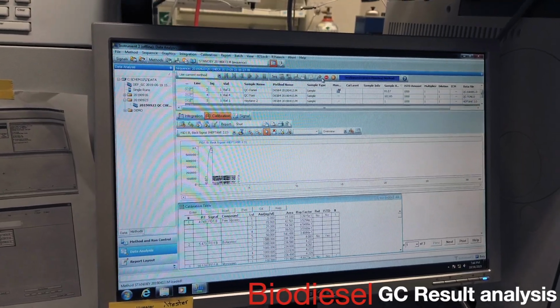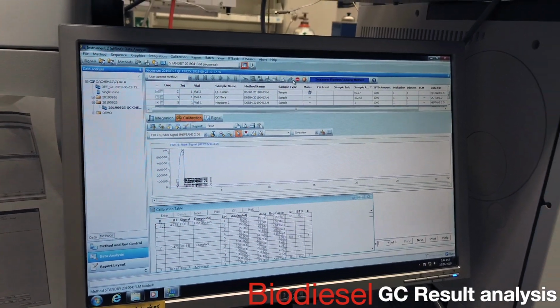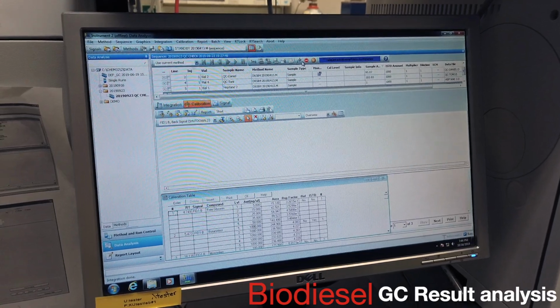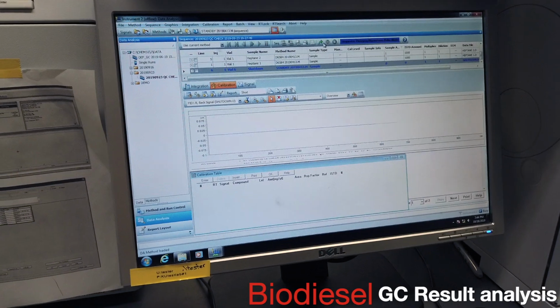I didn't update the internal standard amount. Well, but that internal standard amount you've put in, but you're using it from the method, not from the data, not from the sample. Oh, that's true. So it's still going to show us 1,000. Yeah, you're right. So you've changed that already? Yeah, I changed it.